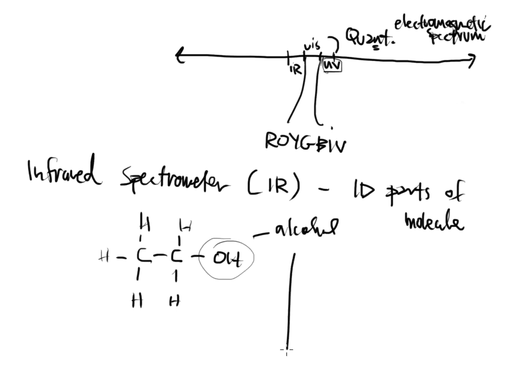So what happens is that in this system, we will expose this molecule to infrared energy, an IR light beam, if you want to think of it that way. And this IR light beam will shine onto this molecule, and this molecule begins the workout routine. And OH will go to work. And OH will begin to work out the same way every single time it shows up.